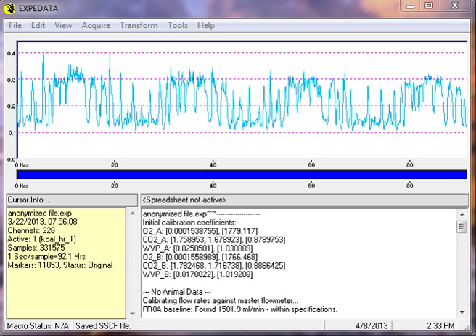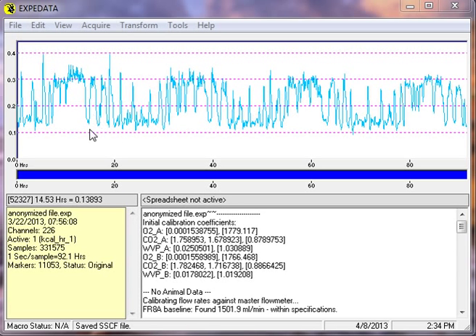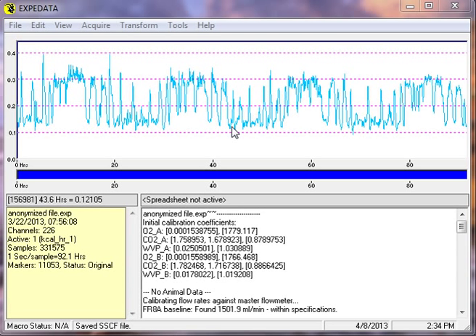In front of you right now you can see the energy expenditure file, or channel as we call it, of a single mouse. In this particular case it's mouse number 1. Here we have active, this channel is kilocalories per hour of mouse number 1. And you can see that there's some quite large excursions in energy expenditure, and you might wonder what is causing those.